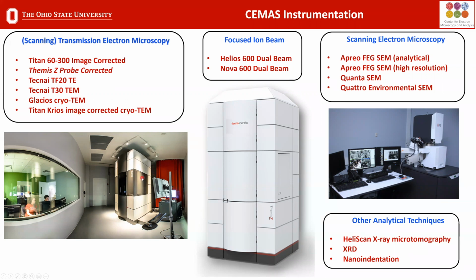This microscope is on the order of 10 to 12 feet tall, maybe taller. And what we put in it to analyze is a sample that is 1,000 times smaller than the width of your hair. I want everyone to understand that we have a machine bigger than 10 feet tall, and we're going to use something 1,000 times smaller than the width of your hair to do all of the analysis that we're going to show coming after this.